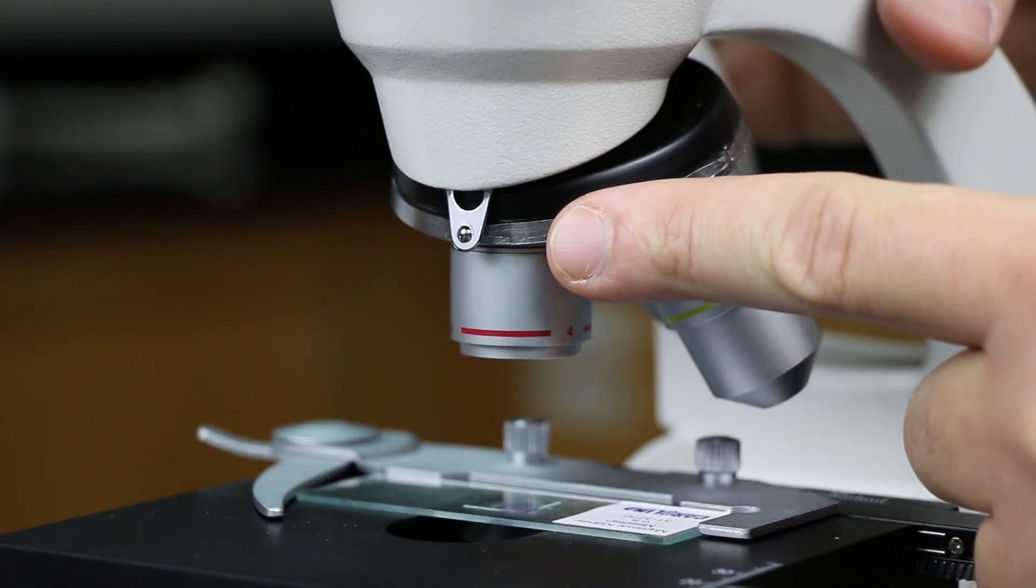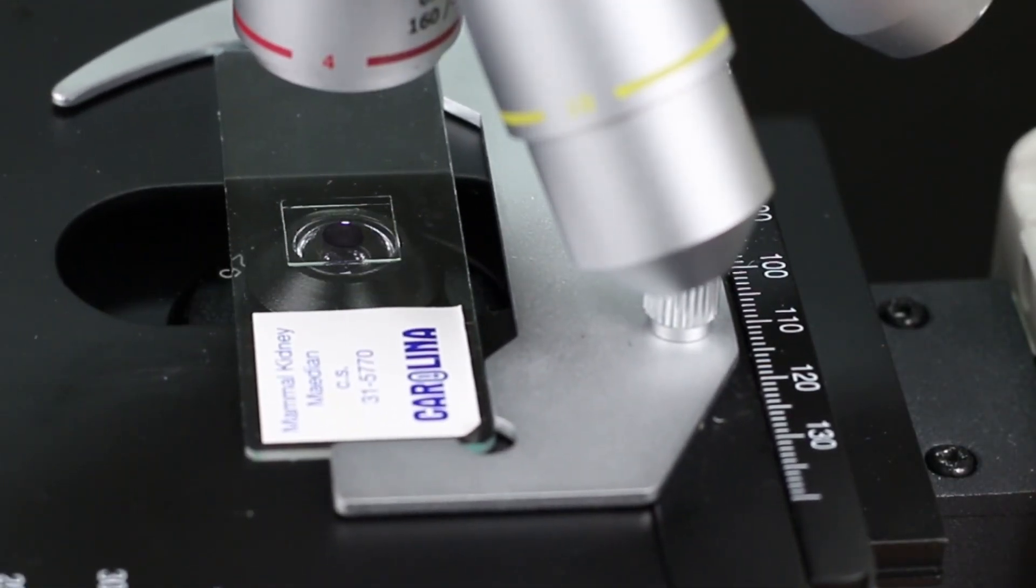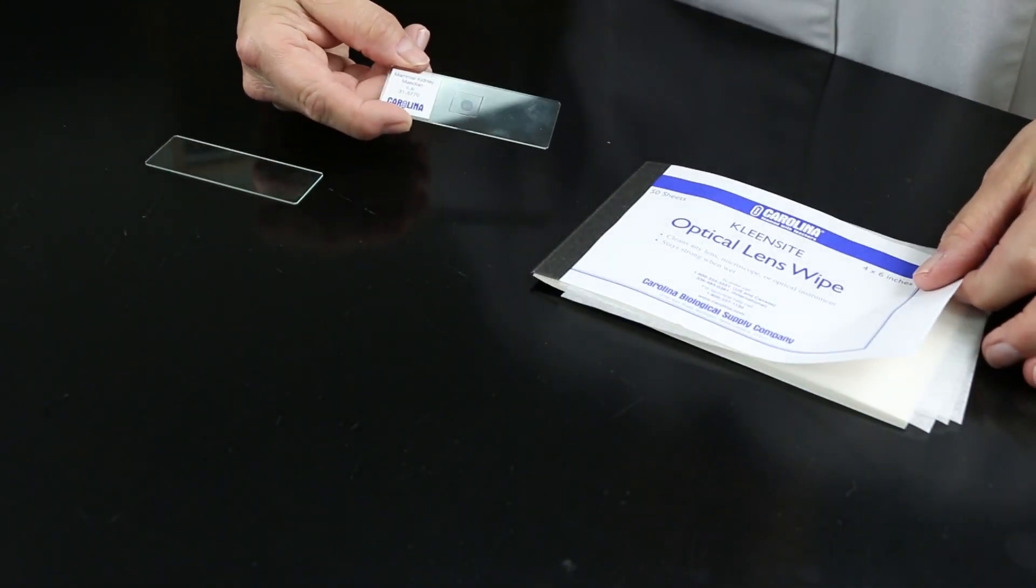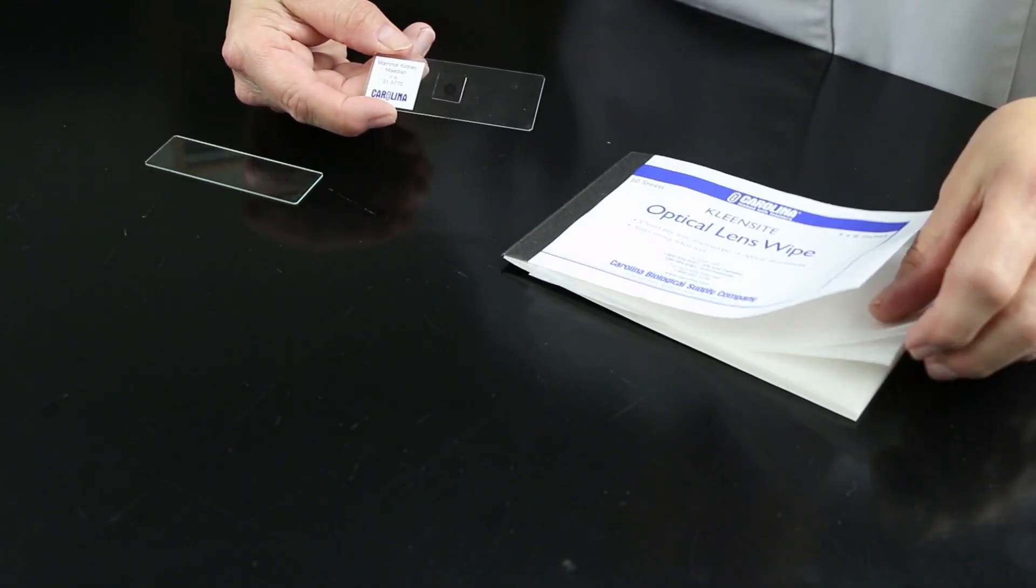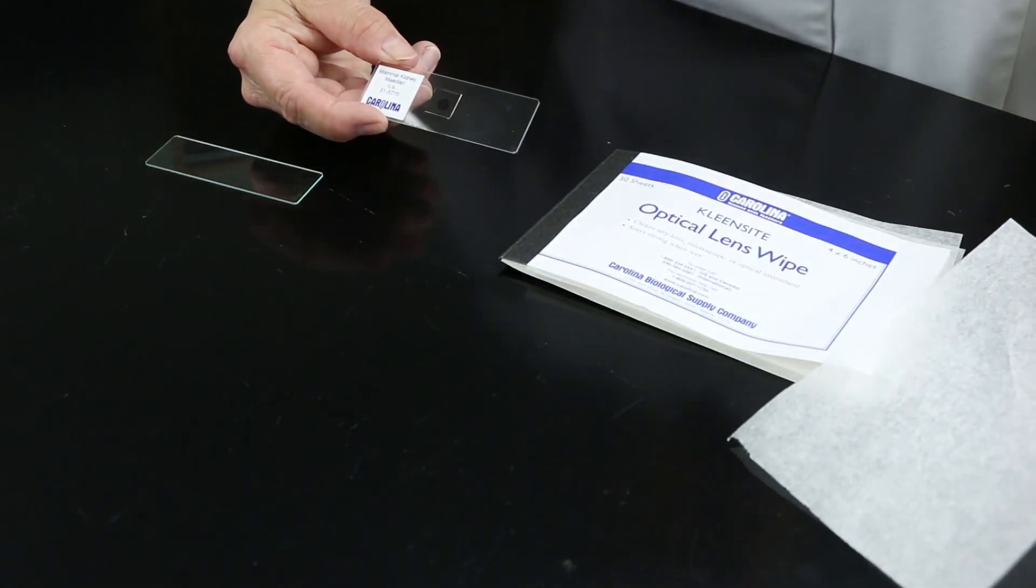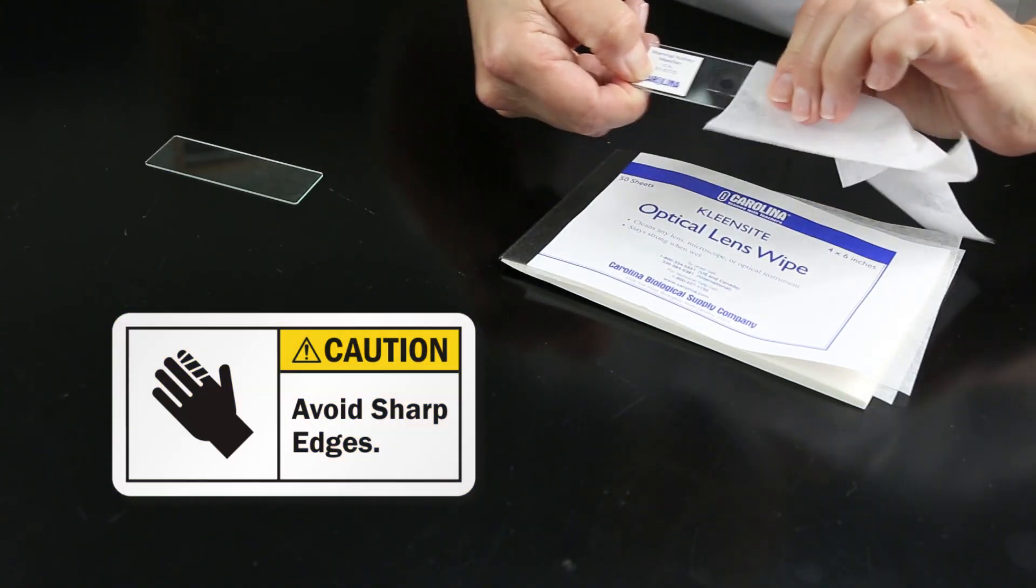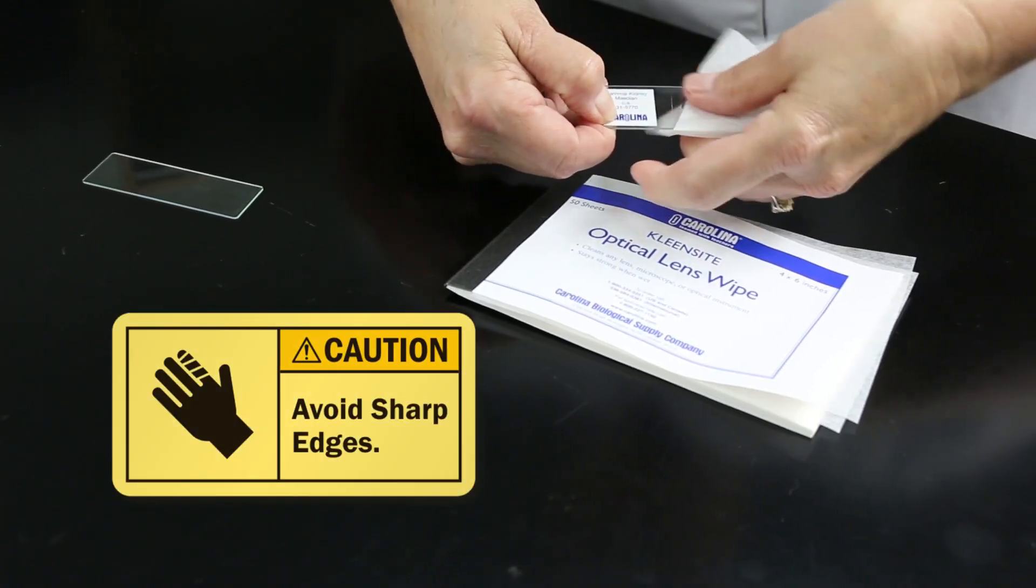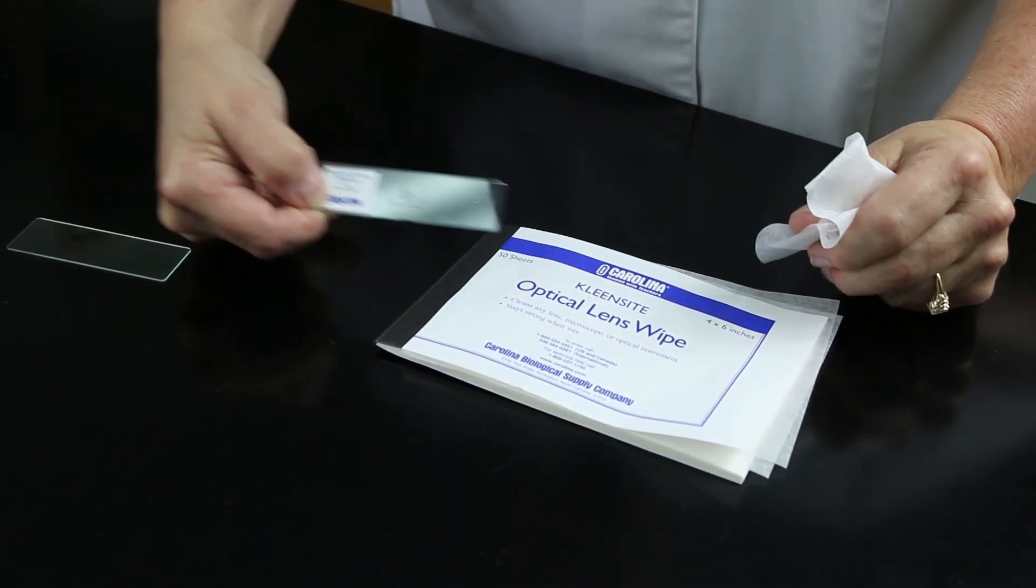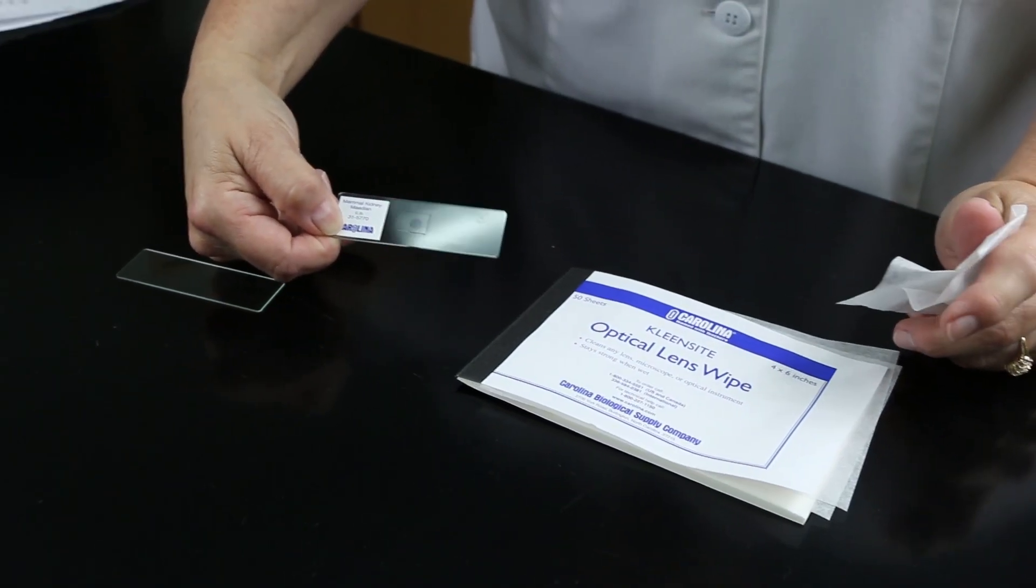Another thing that sometimes is an issue is if the view is blurry. Sometimes of course you haven't gotten it into focus. But then another thing that could be wrong is that your slide is dirty. If your microscope slide is dirty, that's also going to cause some blurriness when you're trying to see it. So what I suggest is that you take some optic lens wipes and gently rub the slide. Be careful not to rub too hard over the specimen, but just around the edges and that should take care of any of the smudginess on your slide that would cause you to have a blurry vision.